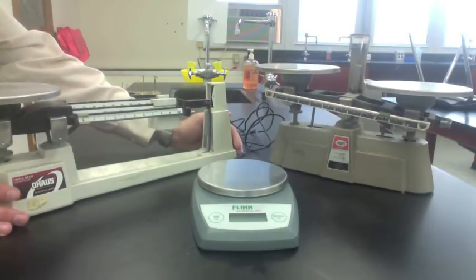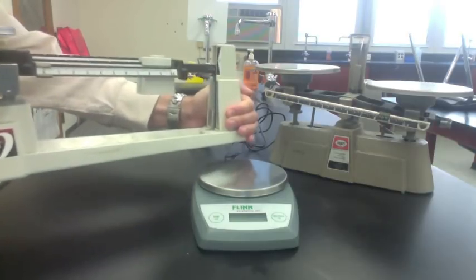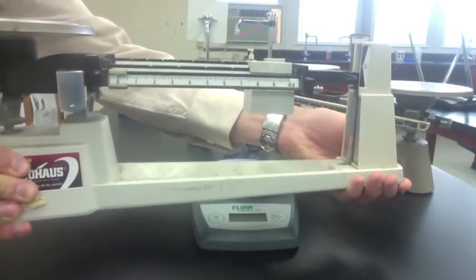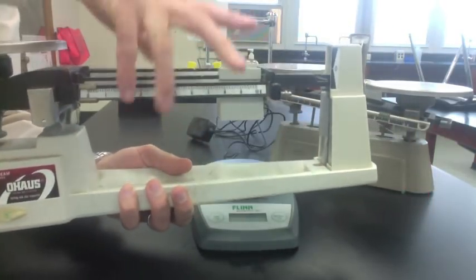When holding a triple beam balance, be sure to hold it by the base with two hands. Keep it secure. Never hold it by the beams — that's how it breaks.